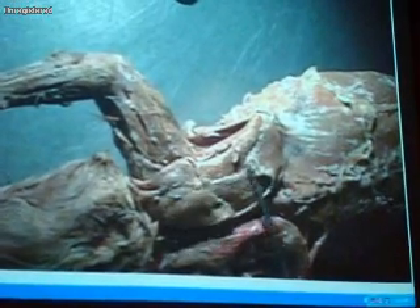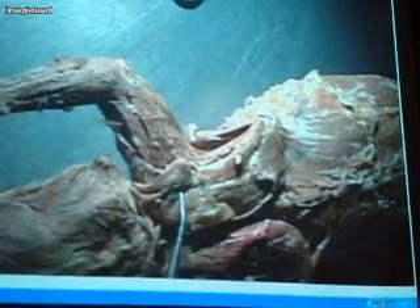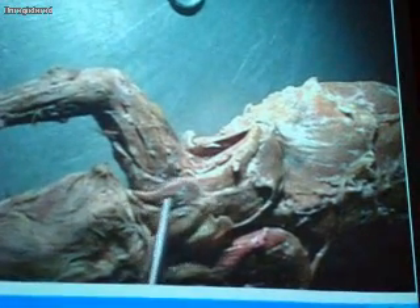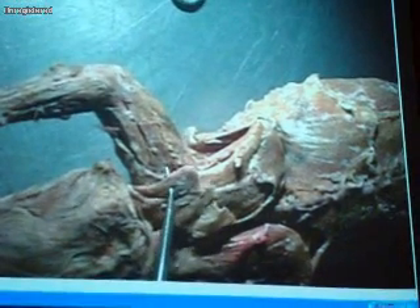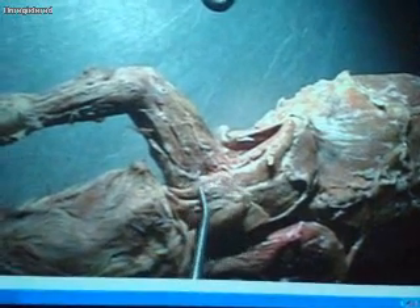Moving up, we don't have a clavotrapezius here, but we have another muscle sitting on the shoulder — a thin muscle — and that's the acromiotrapezius. On the distal aspect of that muscle, there's another little tiny muscle: levator scapulae ventralis. It's a very small muscle right on the edge of the acromiotrapezius.